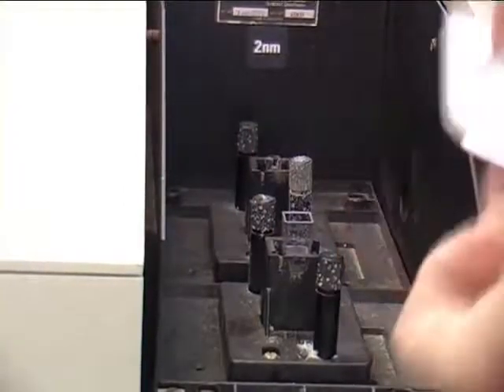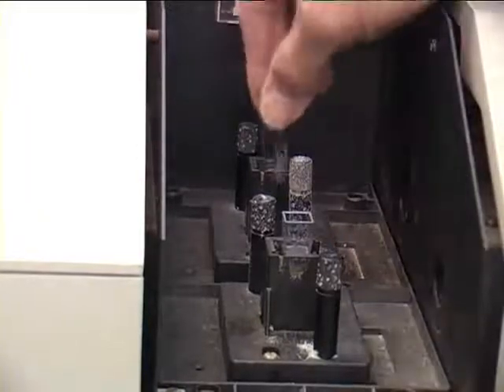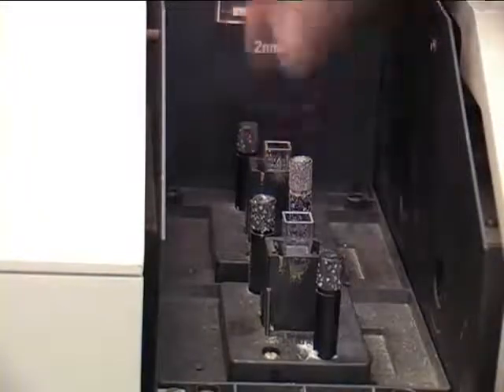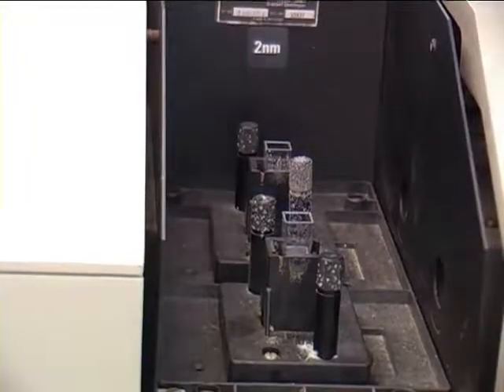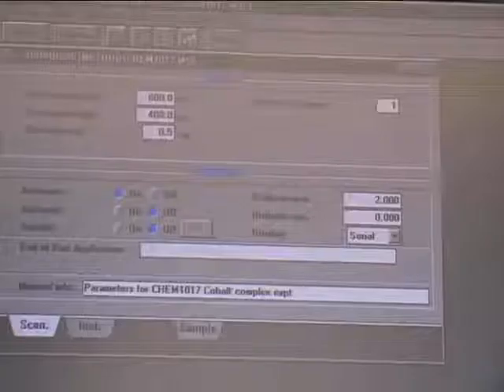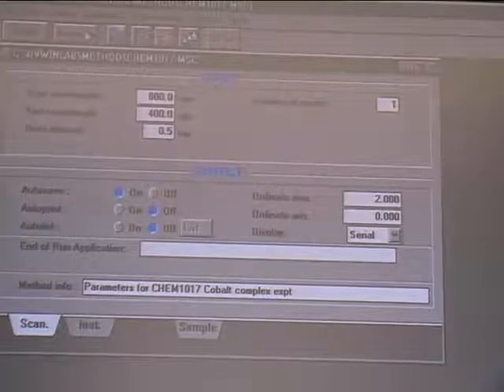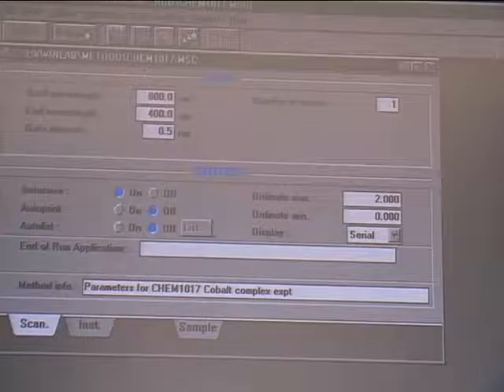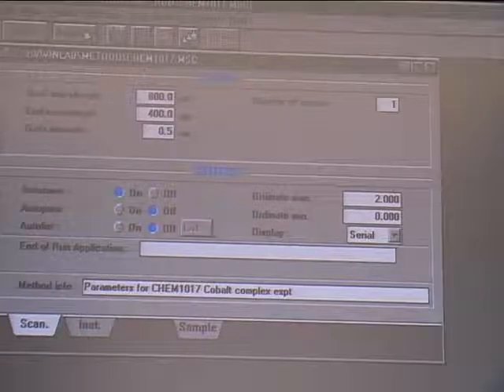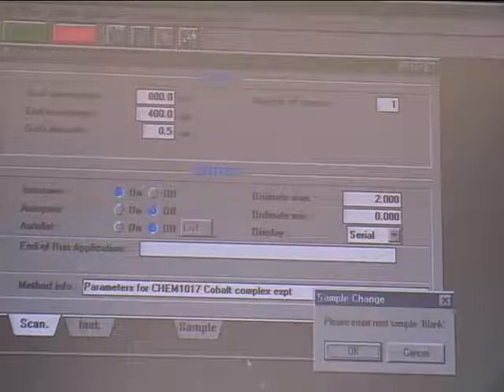The cuvettes are then placed inside the spectrometer and the lid closed. To run the reference, click AutoZero in the UV-Vis program and click OK.